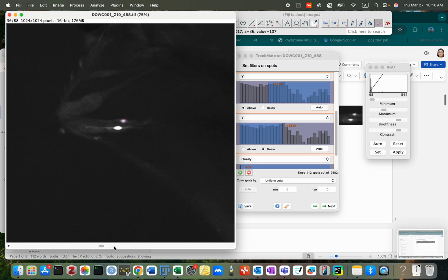However, because of the movement I cannot get it better by setting different filters, which means I need to delete them later from Excel. Okay, that's the best I can do. I want to make sure all the time points of neuron 0 are selected so I can see it. The first setting should be done very carefully to make sure I select all of neuron 0.